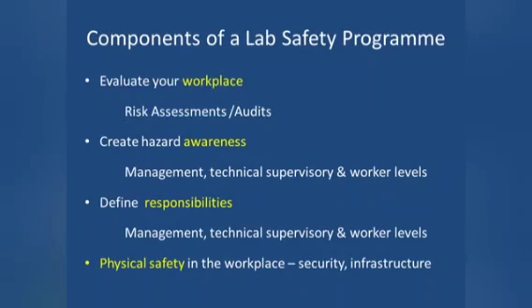Physical safety in the workplace. You need to consider how secure is the workplace, especially for women staff at night. How safe are the premises? Is security provided by the administration? Is entry into the laboratory restricted? These are the hazard awareness issues that you need to look into.